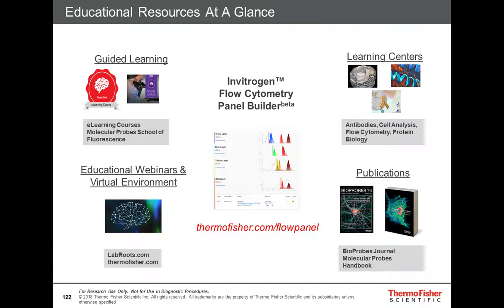My favorite method is the easy one. But of course, I want to get good data too. So I think the Peak 2 method is the one I like, uses a single bead, looking at the standard deviation and the CV. But there are a lot of methods out there.